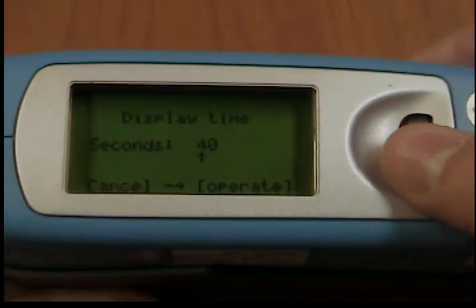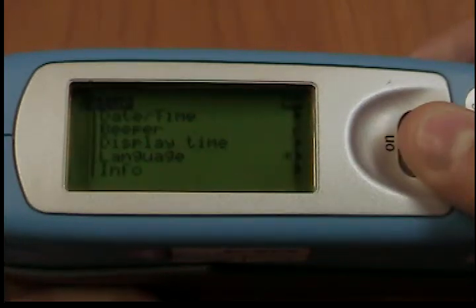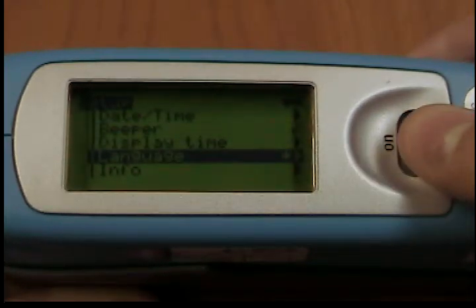Language. You can use this menu to select the display language. Use the scroll wheel to move the mark to the desired language and press the wheel.